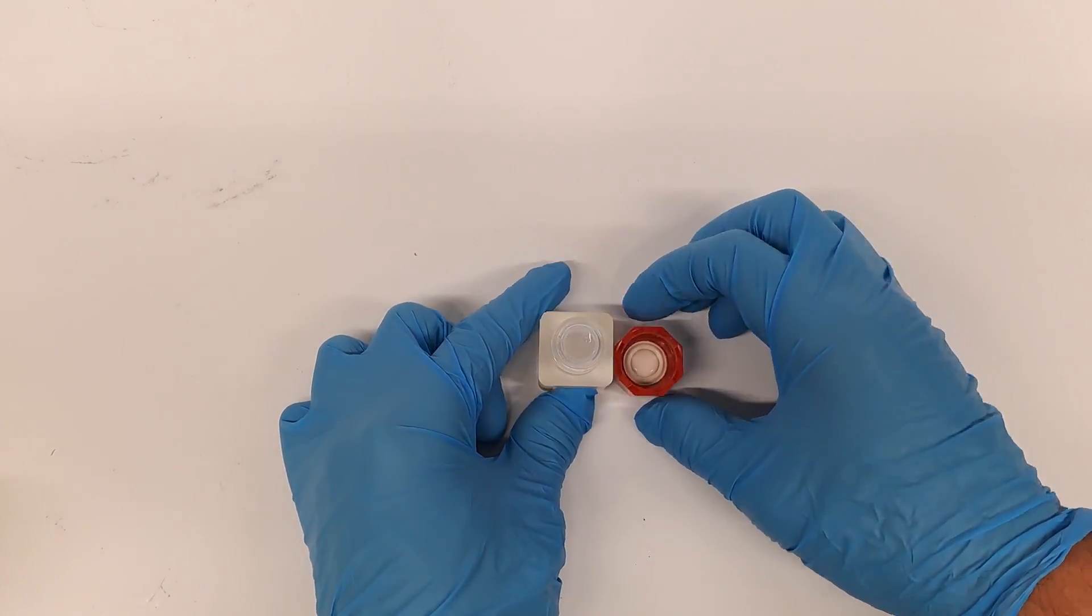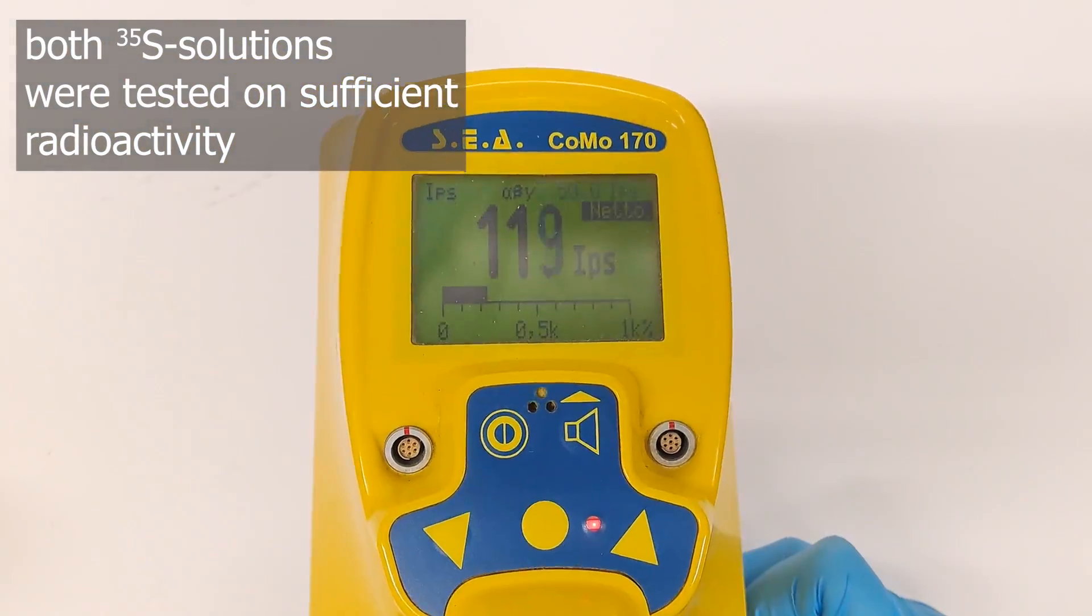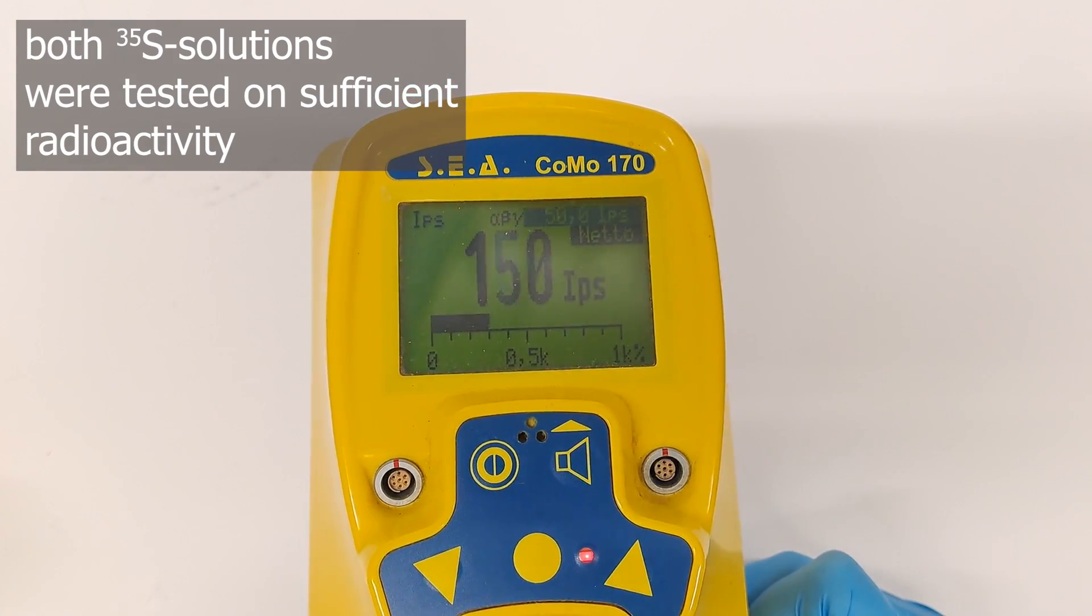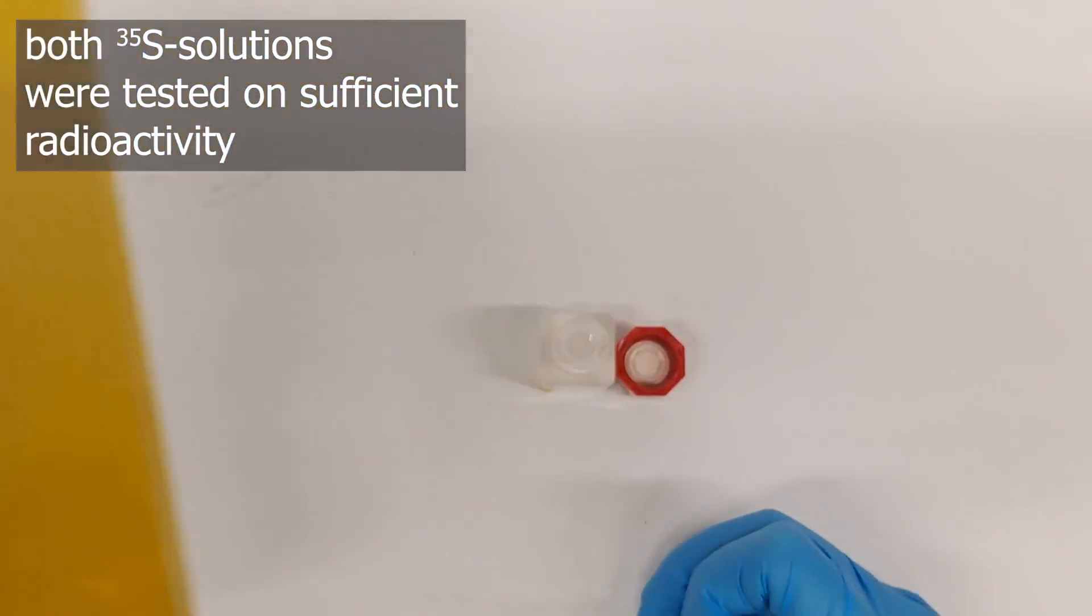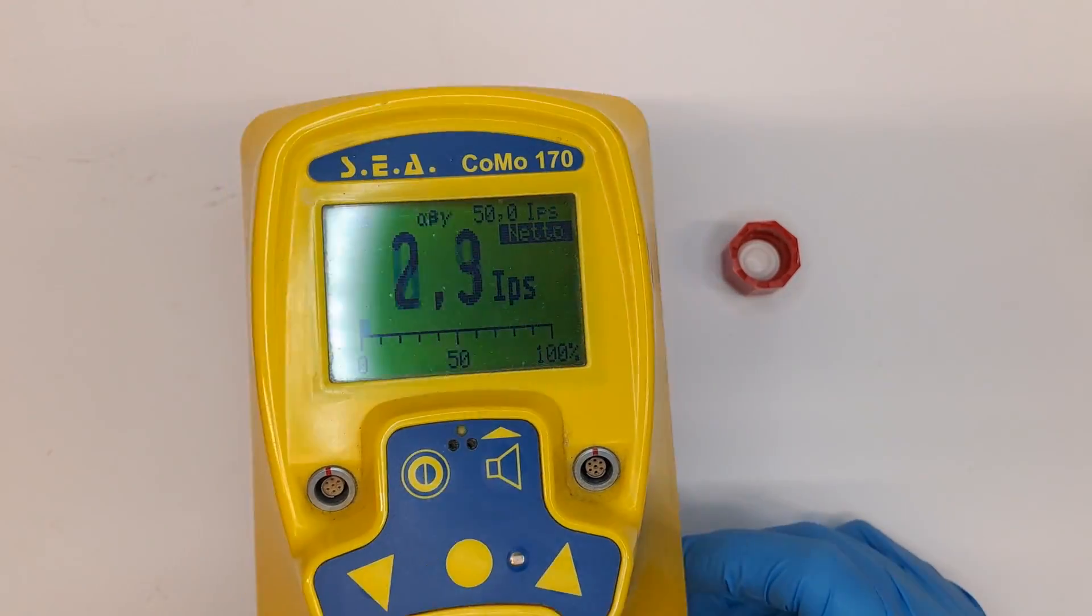Even the low energy betas have some range in the air that allows them to reach the detector. I've mentioned still radioactive for a reason. Sulfur-35 has a half-life of 90 days.